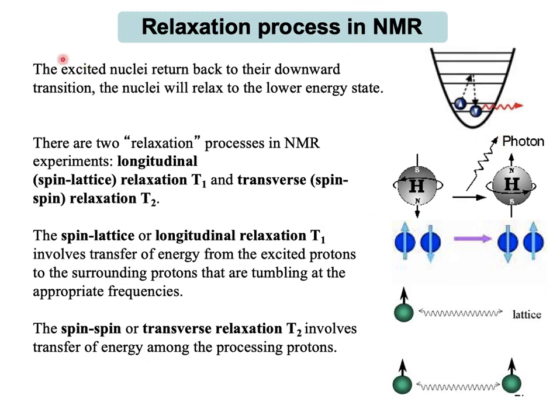After this absorption, the phenomenon of relaxation occurs. The radio frequency is provided to the system for only 10 to 20 microseconds, after which it is switched off. After switching off the radio frequency, the relaxation process occurs, which is very important in NMR in order to get information about the nuclei of an atom.